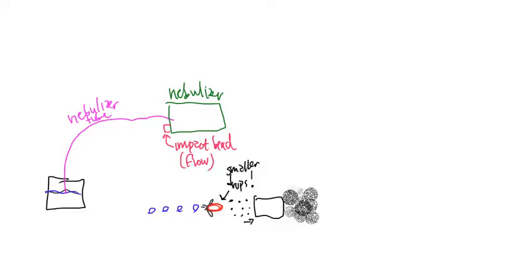This is basically a mist generator because the AA burner head requires the sample to be basically rid of all of the solvent that it can. And the smaller the droplets, the better it's going to be. So keep that in mind when you're starting to suck your sample through. If you don't get the mist here at the end, then your AA is not going to do its proper job. So that's the purpose of the nebulizer.